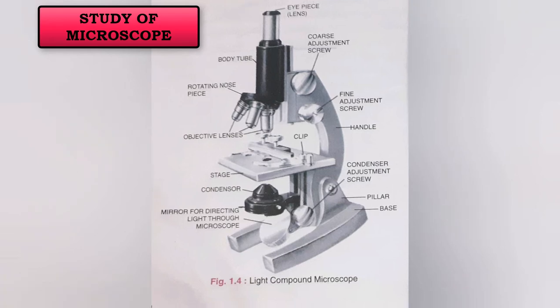The revolving nosepiece, also known as the turret, holds about 2 to 4 objective lenses and allows rotation of the lens while viewing. Next is the arm of the microscope. It is used for holding the microscope, supports the tube of the microscope, and connects to the base of the microscope.